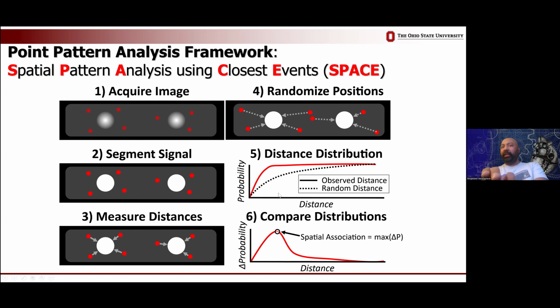And when we take the observed and the random distributions, we literally take a point-by-point difference of those and plot that. That's the bottom right panel in number 6, which gives us a very useful curve because essentially if the observed graph is left shifted from randomness, it means you are seeing shorter distances than you would expect under randomness, meaning you're seeing attraction. And if it's right shifted, it is the opposite. You're seeing longer distances. It is repulsion between these two components of signal.